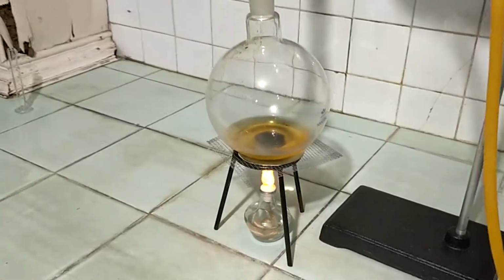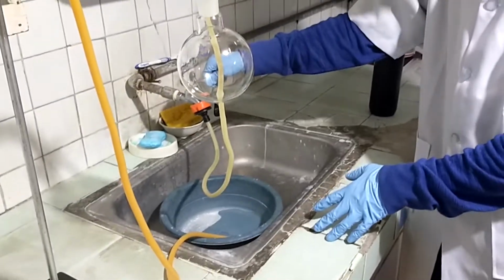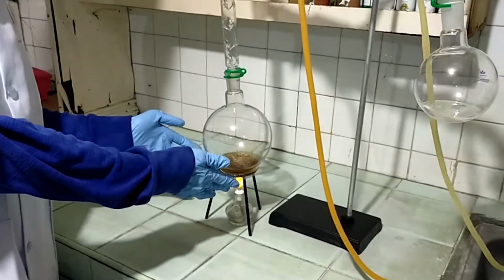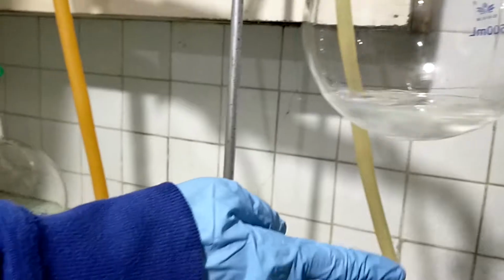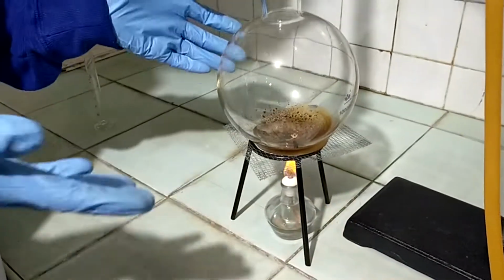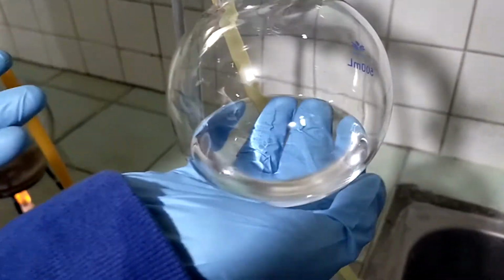I am now starting my water in, water out. Okay, so now you can see that my organic liquid is now boiling. As you can see, I have here now a distillate in my condensing flask, and I have here my water in and water out. Okay, so it has been around 30 minutes since I first started distilling this. You can see there's only a little amount of liquid left in this flask, and most of the liquid has condensed into this condensing flask.